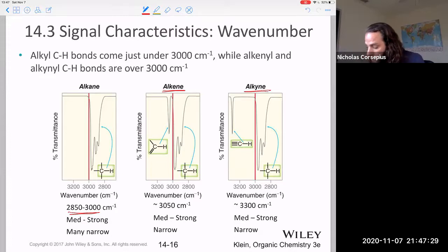Okay, so if you have an alkene, that's a peak that sits at around 3050. It tends to be on the lower end of things. It tends to be smaller than the sp3 carbon hydrogen bond, but it's nice and very narrow, right? So again, we draw that line at 3,000, and if there's a peak sitting just north of that, then it's an alkene. Okay, again, around 3050. Unfortunately, what you're going to see from sample to sample is, you know, hexene might be 3080, whereas pentene is 3070. It can fluctuate a tiny bit. So don't take the 3050 as exactly that, right? So unfortunately, there's some experimental wiggle room here.